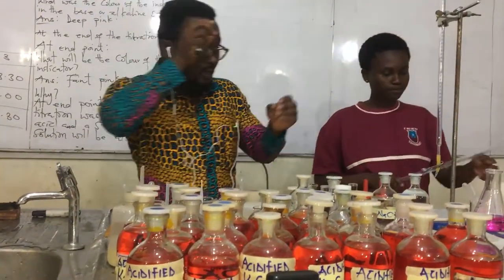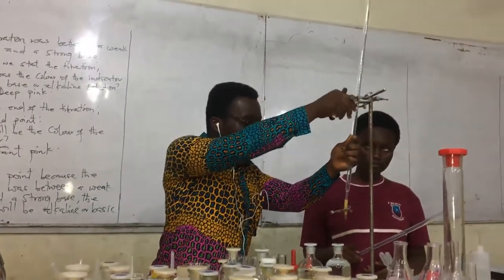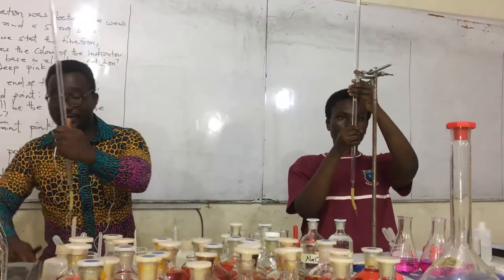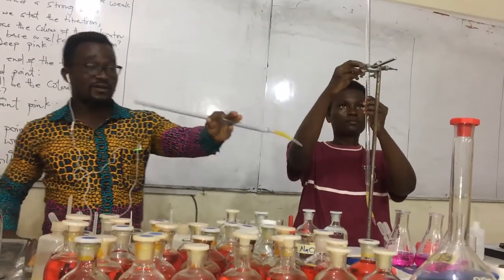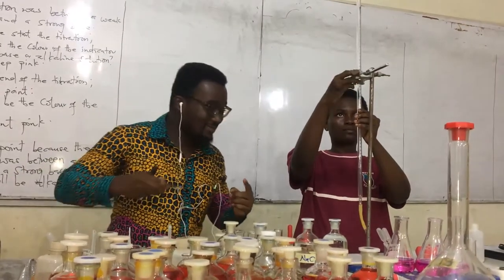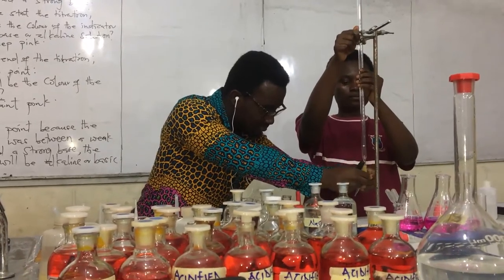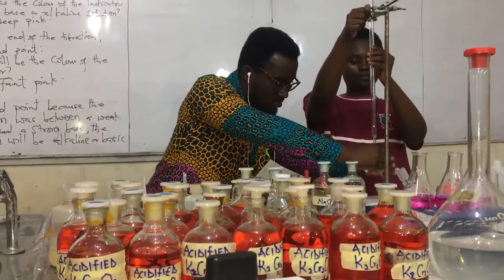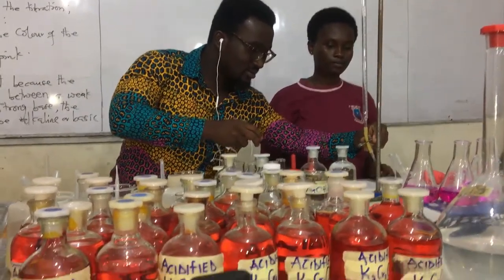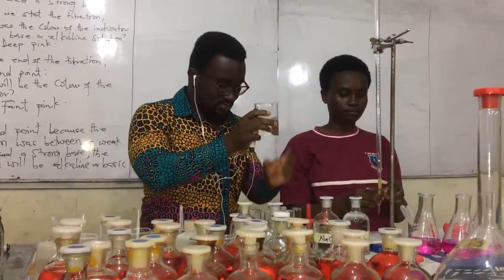So everything is set. You want to unmount this and then replace it with another one, so that we don't go through the problem of rinsing again. We have enough. So she's mounting another burette, which has been rinsed nicely. Sorry, it has to go to this side.